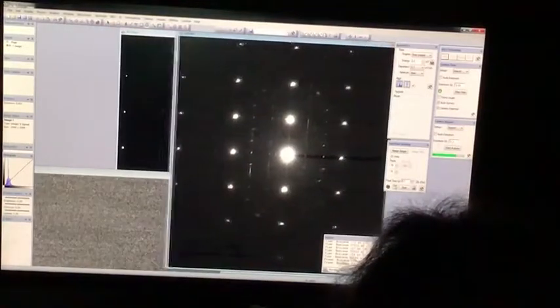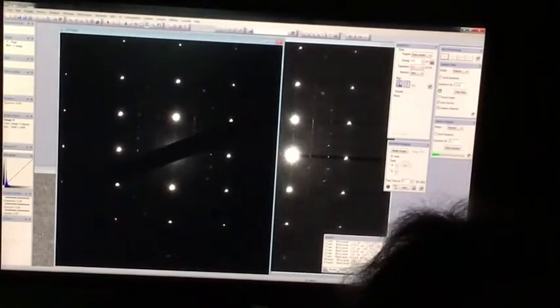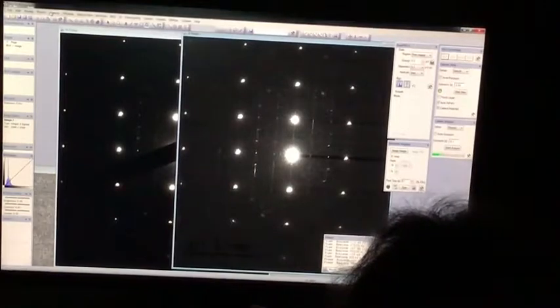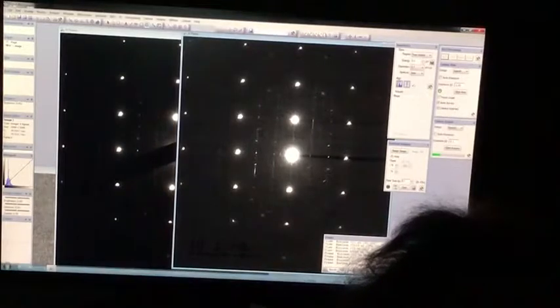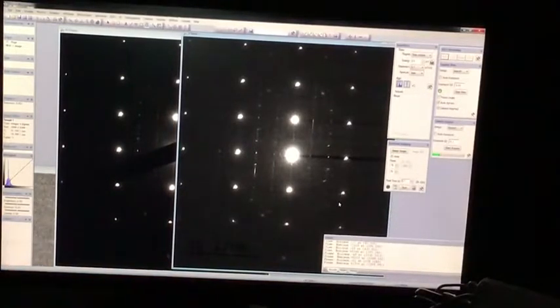Okay, so that's the central beam right there. And so we should save these. Analysis, statistics, let's see. Oh wow, still quite high. Unfortunately so. The only way we could actually deal with this a bit better is to change the camera length to being higher, which I will do, because it'll help with your measurement accuracy as well. See if we can do it sensibly now.